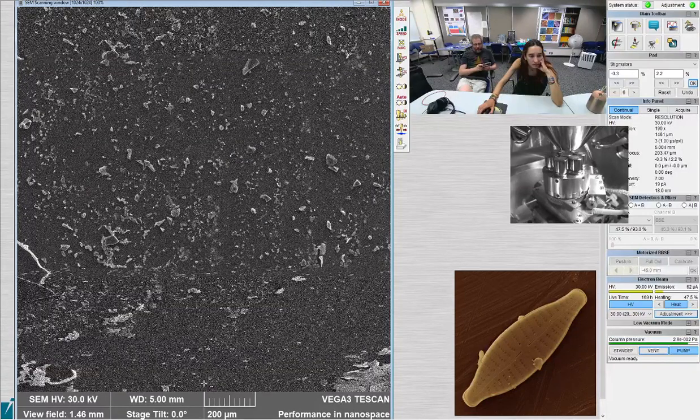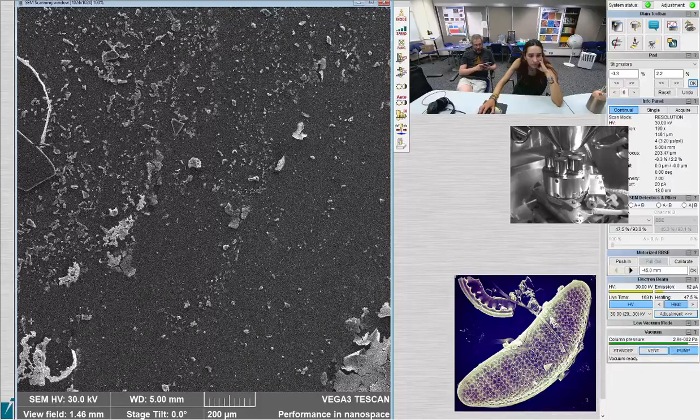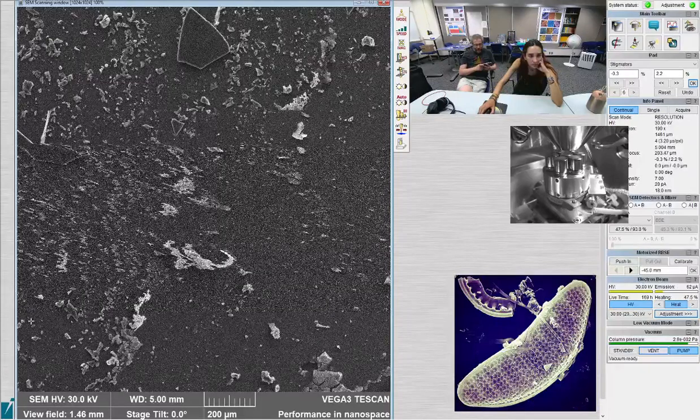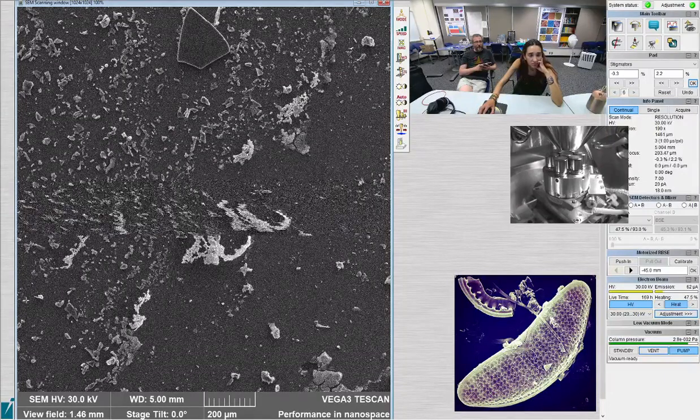Oh, somebody asked a question and I missed it because of the window closing. What's all the fuzzy stuff that doesn't look like anything between things? Ash? It's either clay or some ash.